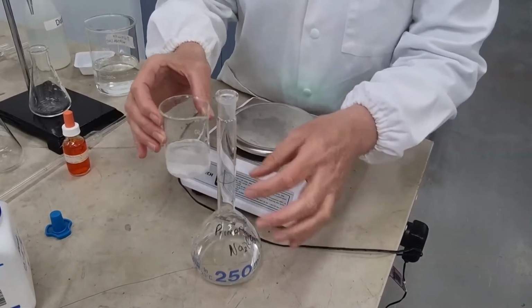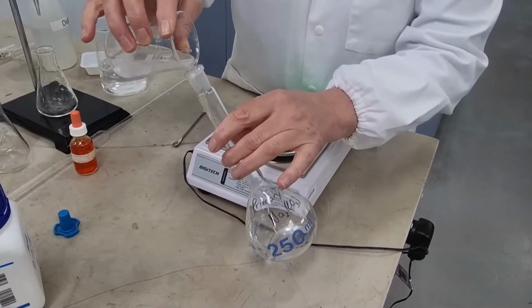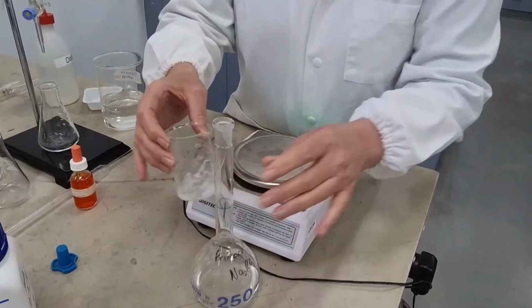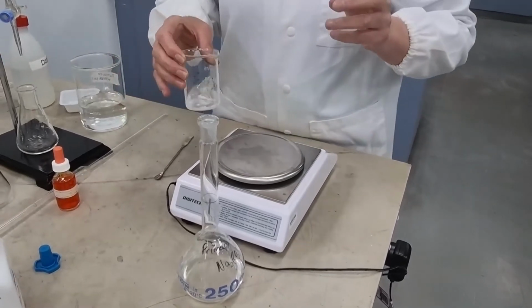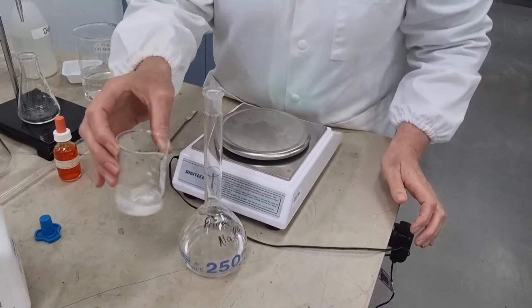You also need to make sure that it's labeled, because we're going to dilute our acid as well, because it's too concentrated, in a volumetric flask. We'll dilute our acid in this one, and if they're not labeled, then we could get them confused. This has turned into a little solid.